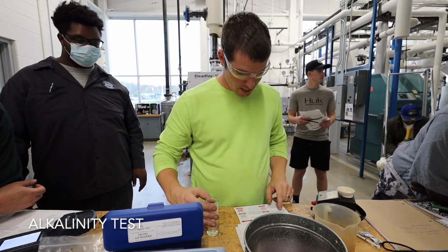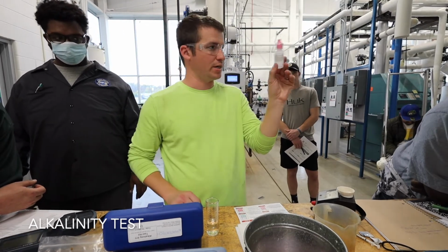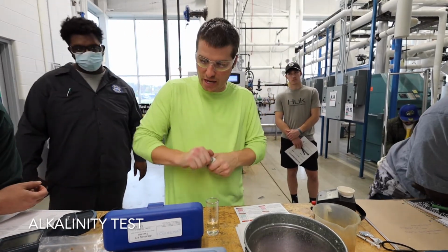Add 3 drops of phenolphthalein, all right? Pink cap phenolphthalein.